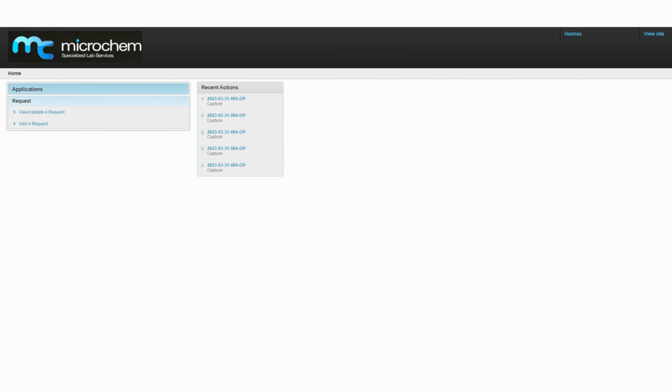And from the landing page, you will have two options. The first option is to add a new request, and the second option is to view previously logged requests. So we'll start by adding a new request to the system.